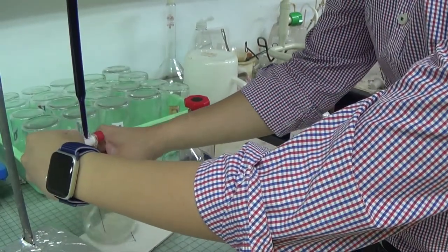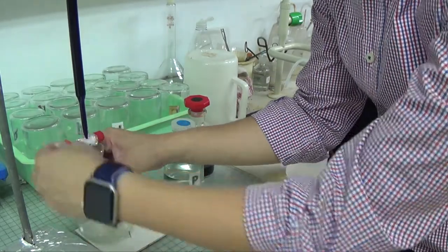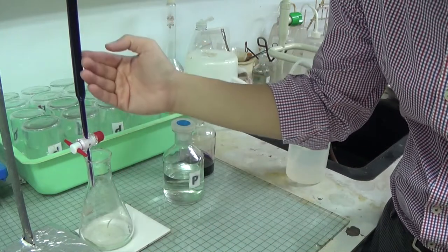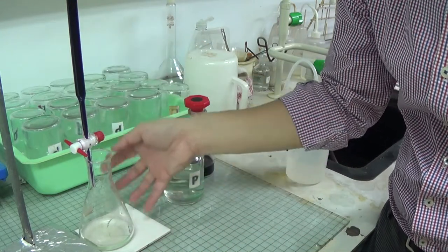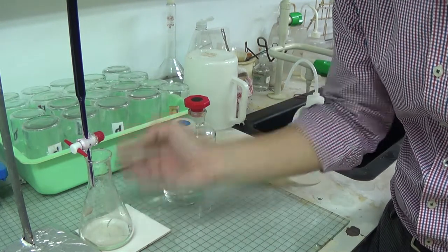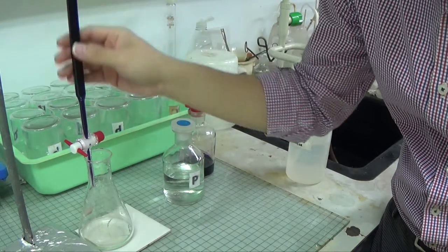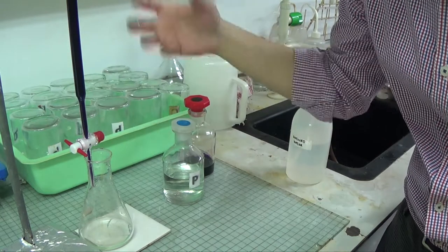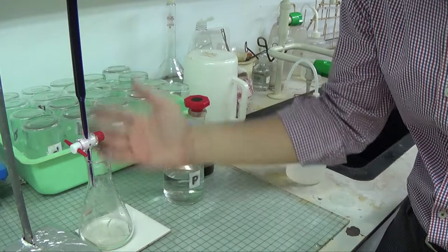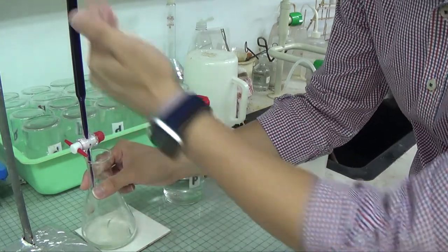So, as you can see, it remained kind of colorless, okay? Because there's still a lot of iron 2 in here, and the MnO4- gets converted to Mn2+. When all the iron 2 has gone to iron 3, when I have excess of this, then it will not go to Mn2+. Because there will not be any Fe2+ to be oxidized to Fe3+, the KMnO4 will remain KMnO4, and therefore I will get a lot of intense purple color when I have excess of this.